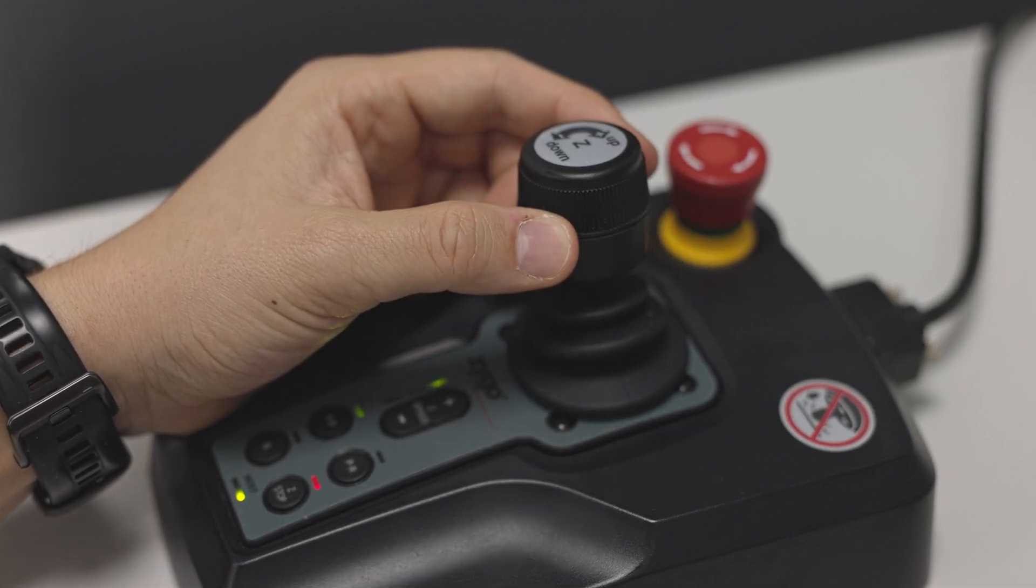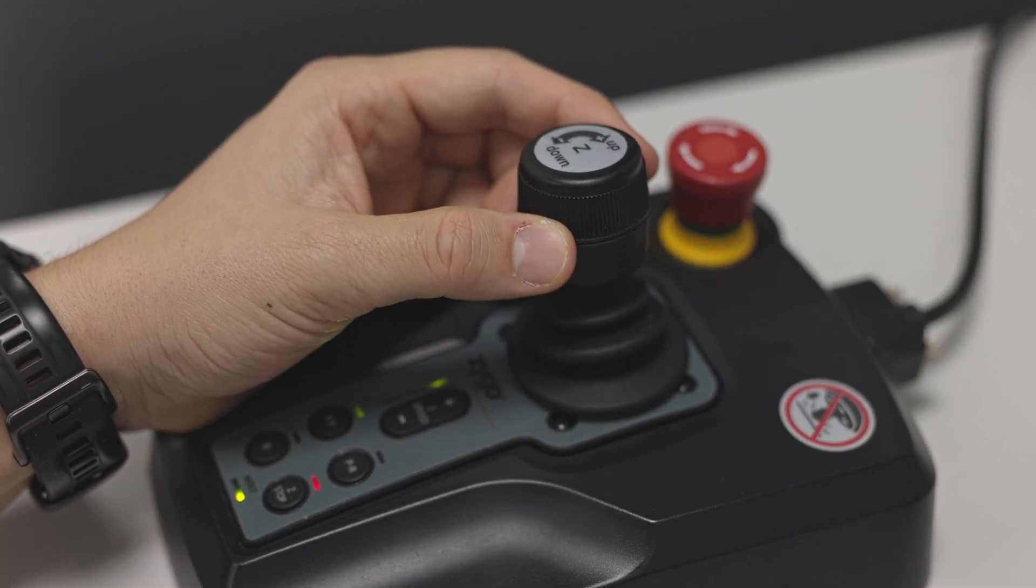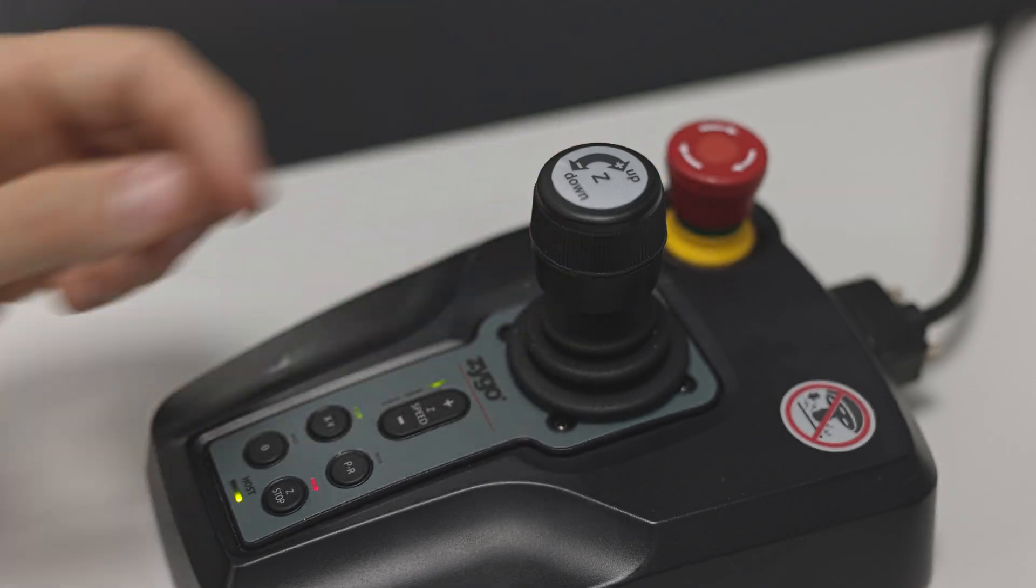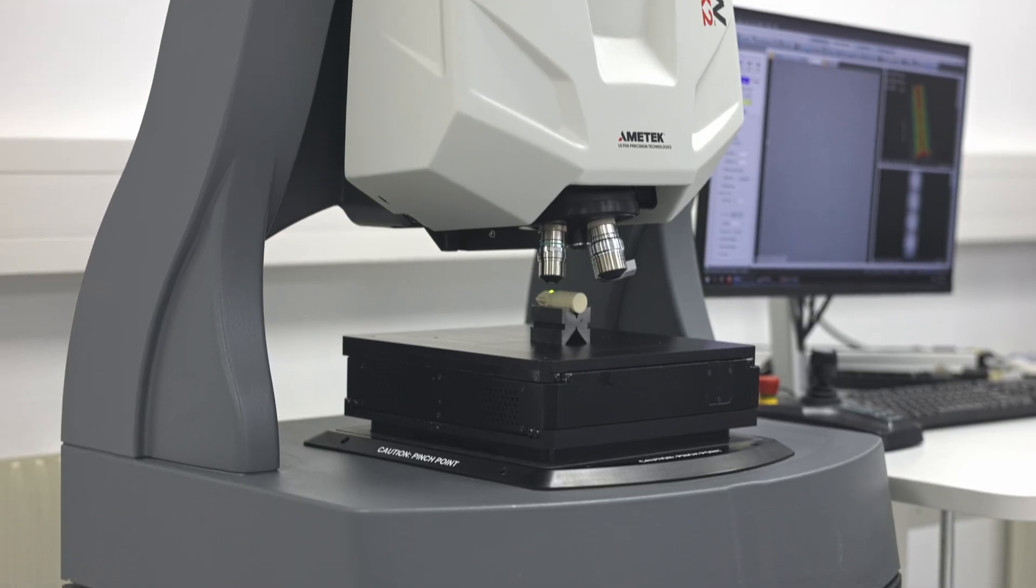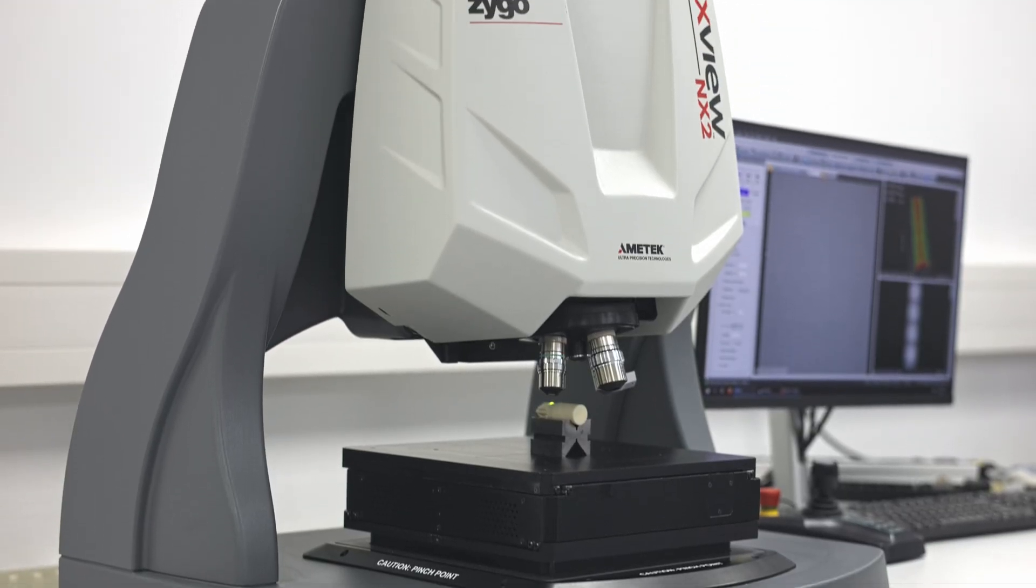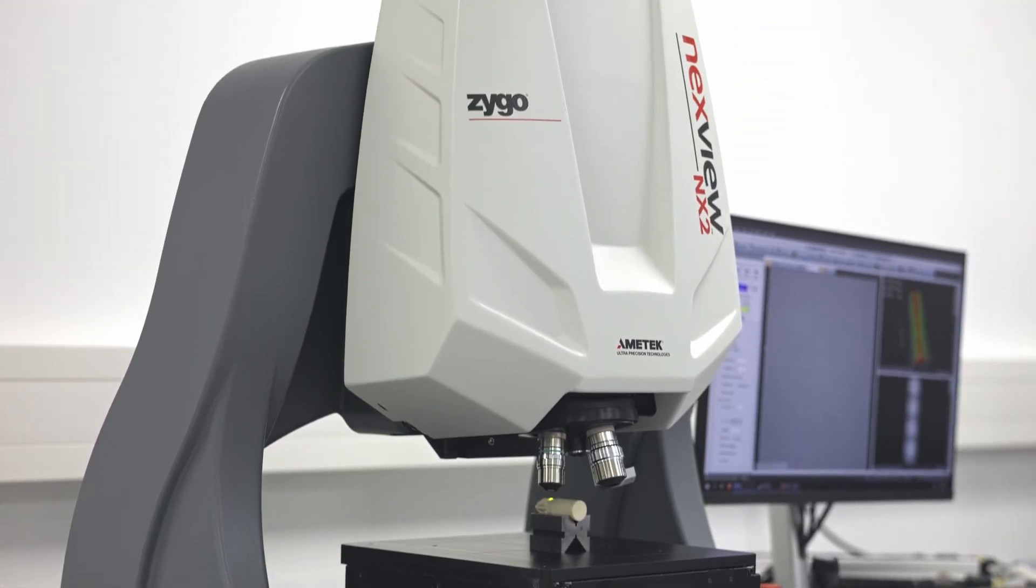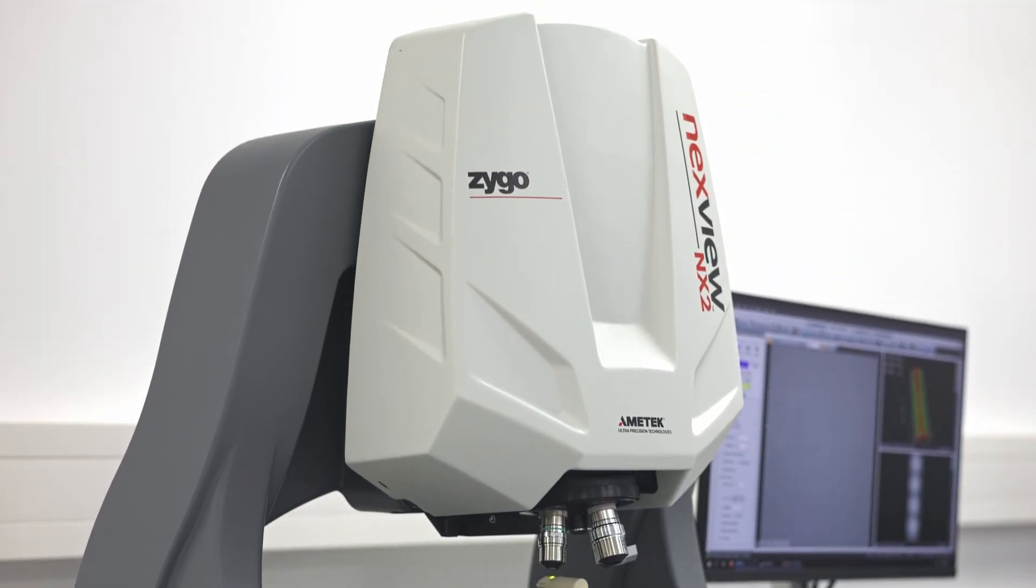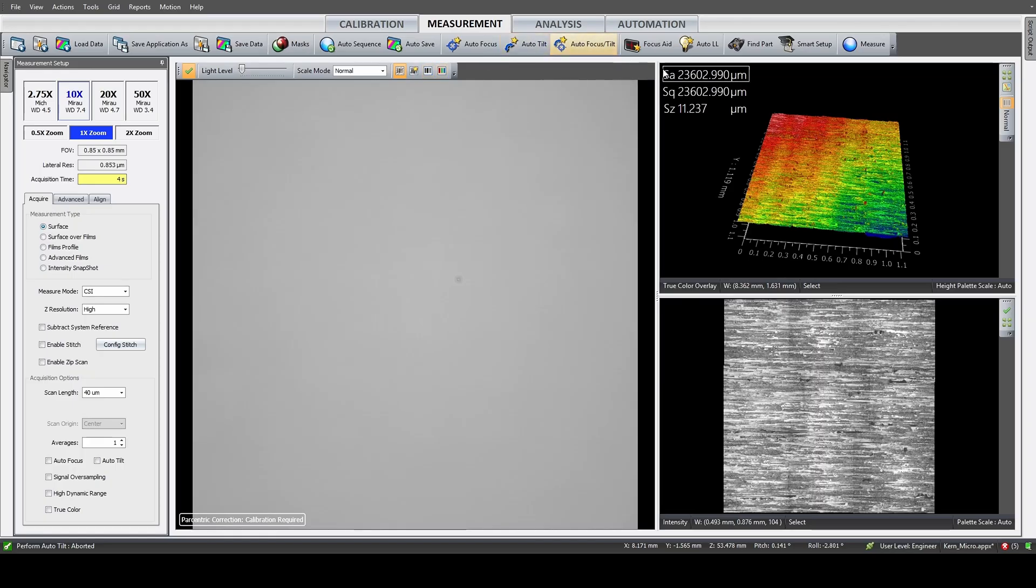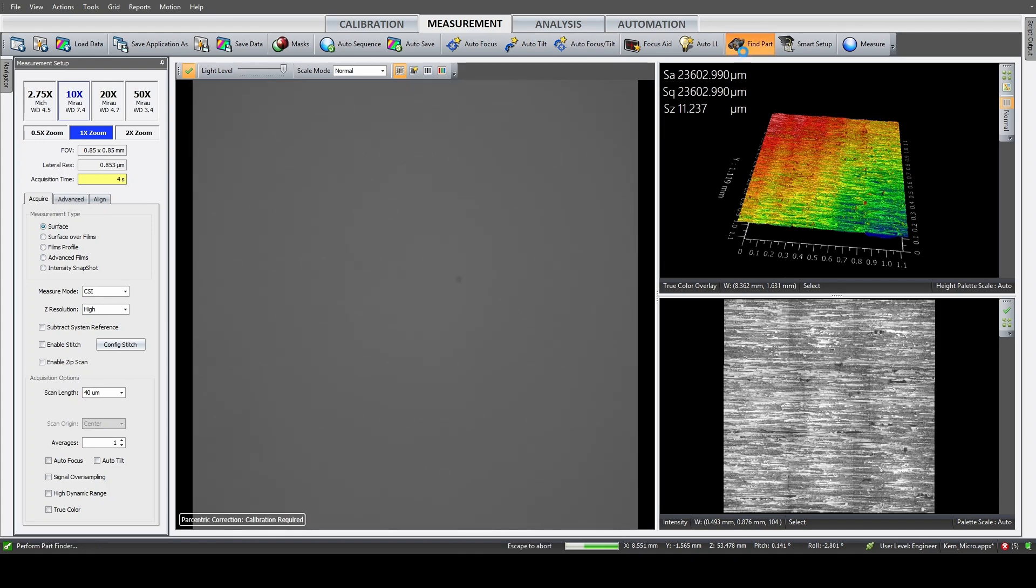Our first sample is a ground surface in aluminum oxide, which is characterized by a pretty rough surface finish. I would expect something in the range of 3 microns here. In the video, you can now see me measure the surface.